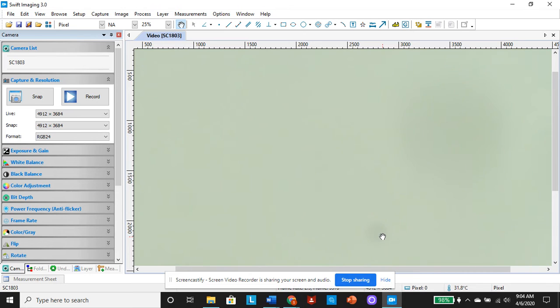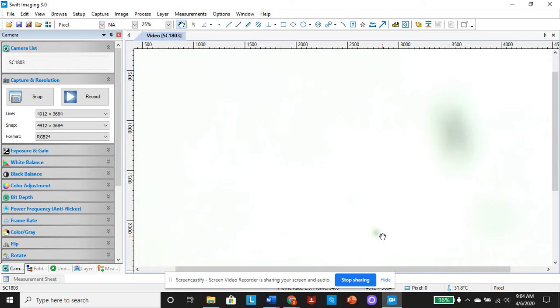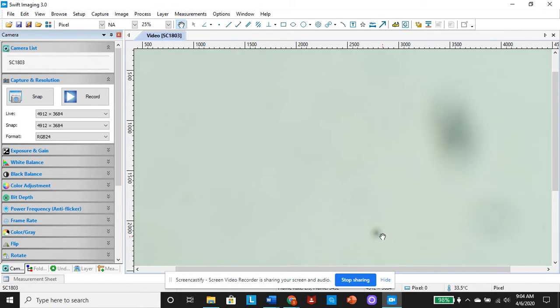You saw some bubbles there. Sorry, guys. All right, getting back into it. That was my bad. Okay, cool.